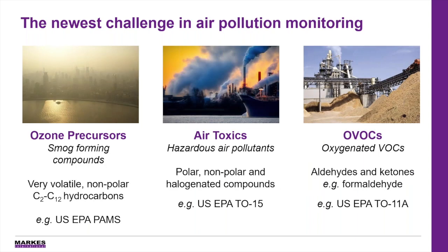But TO15A is just one of the new challenges in air pollution monitoring. Another one that we're going to talk about today does involve air toxics as well, but it also involves ozone precursors, which are the smog-forming compounds, usually very volatile non-polar hydrocarbons, as measured in the US EPA PAMS network, and oxygenated VOCs, such as aldehydes and ketones. And a compound of real interest here is formaldehyde.